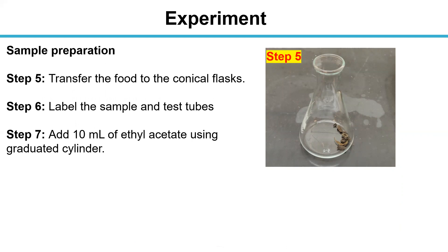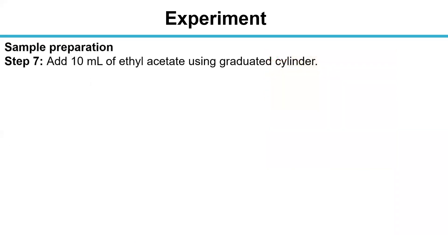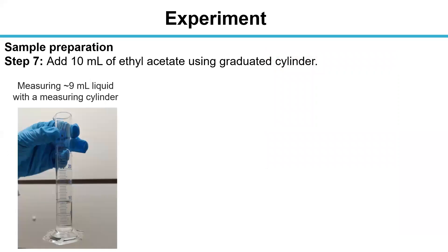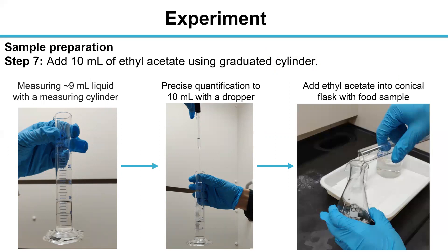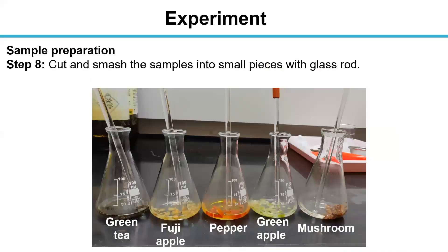In step 7, we add 10 ml of ethyl acetate using a measuring cylinder. We measure liquid with the help of a measuring cylinder and a dropper, then add ethyl acetate into the conical flask with the food sample. Then we cut and mash the sample into small pieces with scissors.